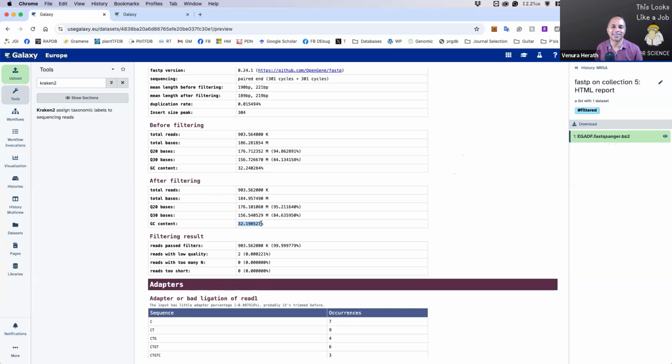You just eyeball it and say it, because if you look at the distribution, you will see that it will be a curve. And if you look at the second one, it will overlap because we allow some flexibility within the distribution. So therefore, it's negligible. You can't do a statistical test. I mean, if you want, you can. I'm pretty sure it will come out non-significant as well.